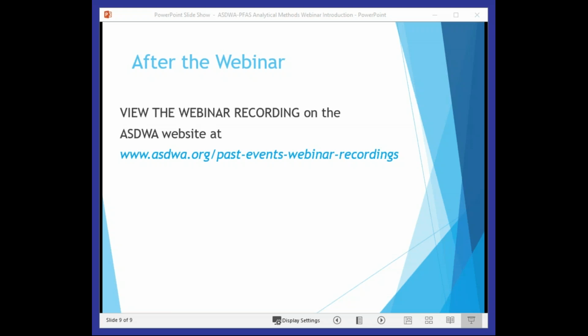Yeah, can you read it again? It says building an existing basic laboratory. It looks like there might be a word missing. It says they already exist. Is it only for the EPA 537 method? So I'm not sure if that's referring to additional methods that are being developed. Okay. Let's see, I have another question here. Is instrument modification always required to avoid contamination?